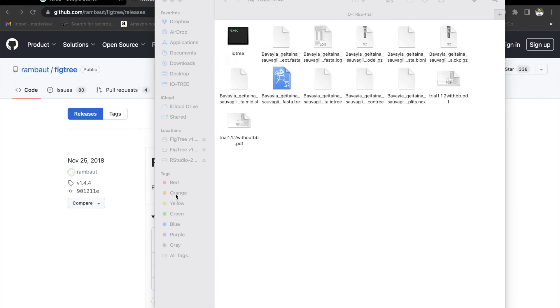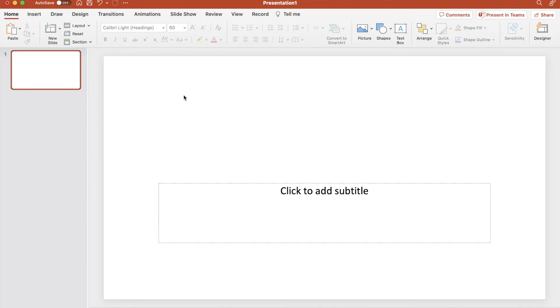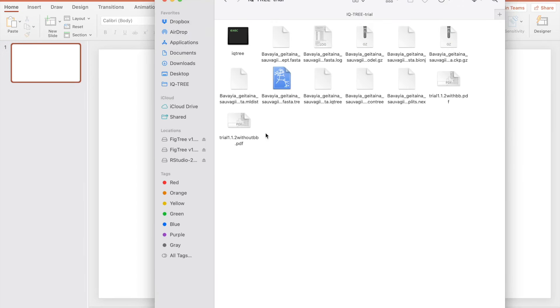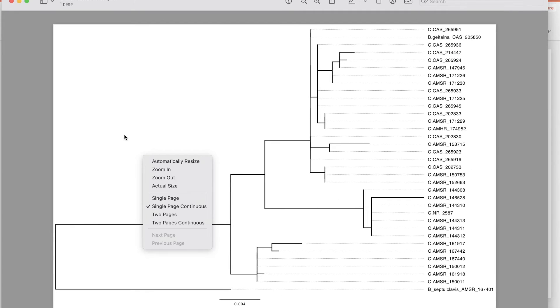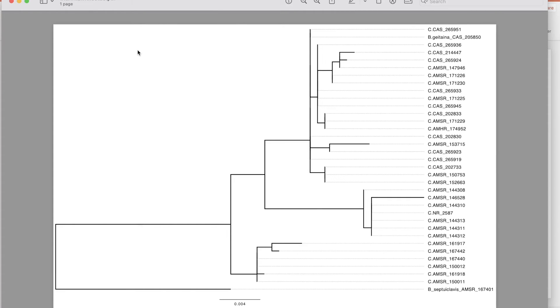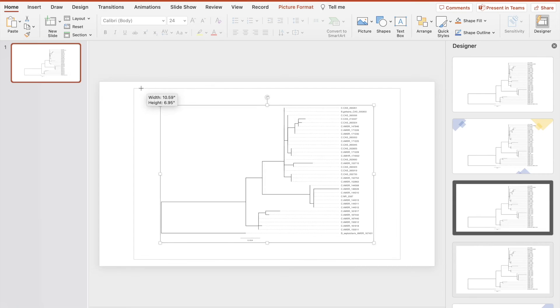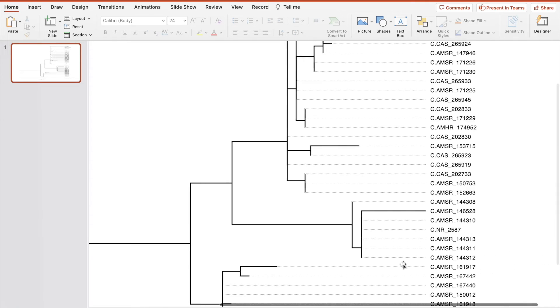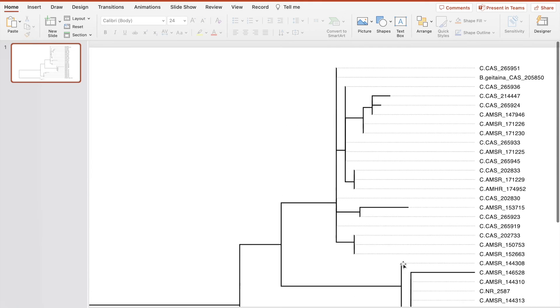Let's open PowerPoint and create a blank presentation. Now, open the PDF without the bootstrap values. Copy this page by pressing Command and C, and go to PowerPoint and paste it. This is where we are going to start putting the bootstrap values.